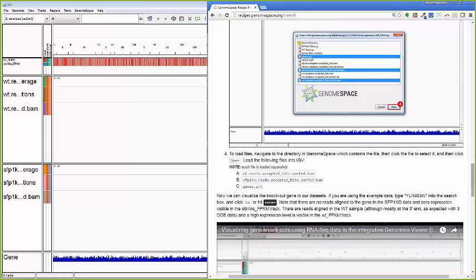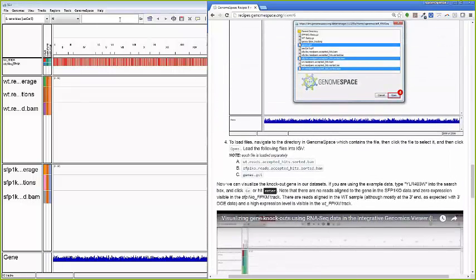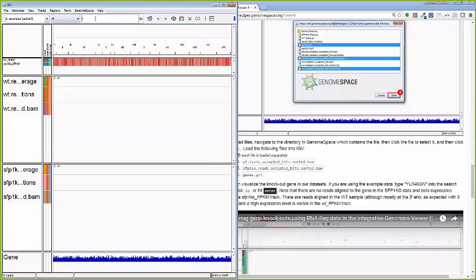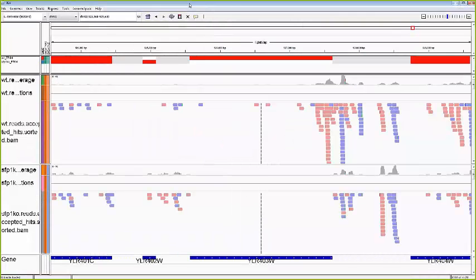If I go all the way to the beginning and look at the inputs, I can learn that the sample that we're using is a Saccharomyces cerevisiae knockout of the SFP1 gene, which corresponds to the YLR403W gene in yeast. So I'm going to search for this YLR403W gene, and up here in this box, I can type YLR403W, and now IGV will zoom in on that location.